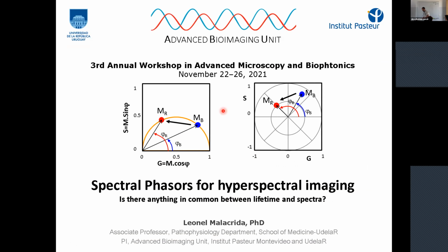Okay, so I am going to talk now about spectral phasor for hyperspectral imaging. And the first time that I gave this talk at the LFD, Enrico put me this in front, saying, well, what is in common and how can we take advantage of the phasor to also acquire and analyze imaging from hyperspectral imaging. And I was working on this even before I moved to the LFD.